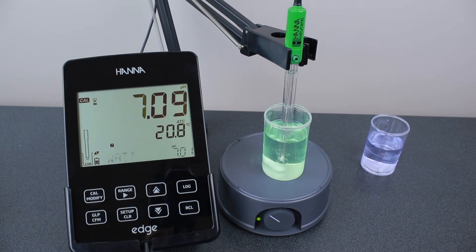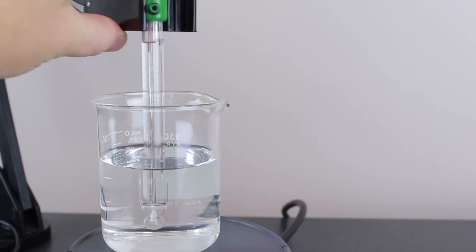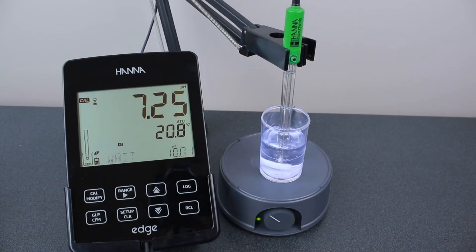Once again, once stable, press confirm. Rinse the electrode again and place it into your pH 10.01 buffer. Once you have calibrated your three points, press the CAL button to save calibration and return to measurement mode.